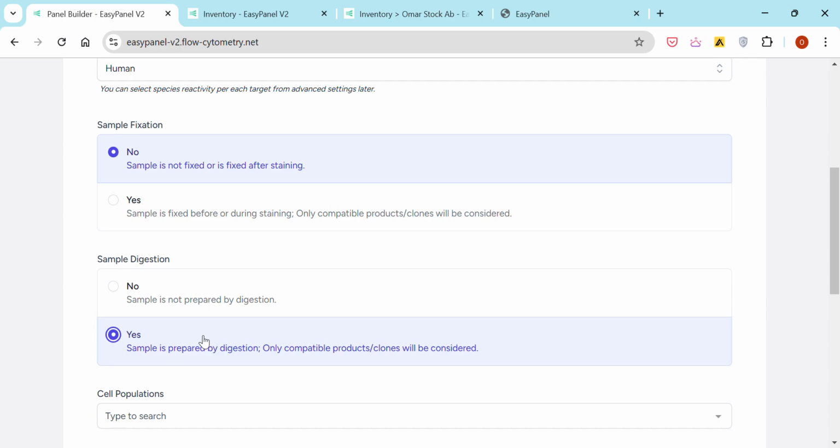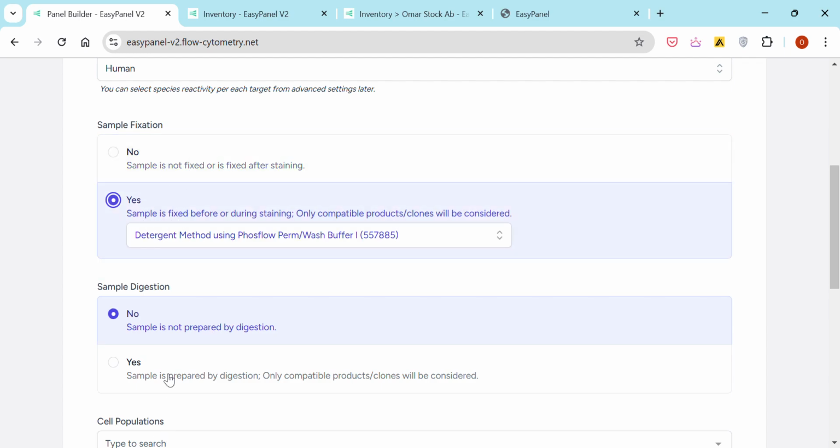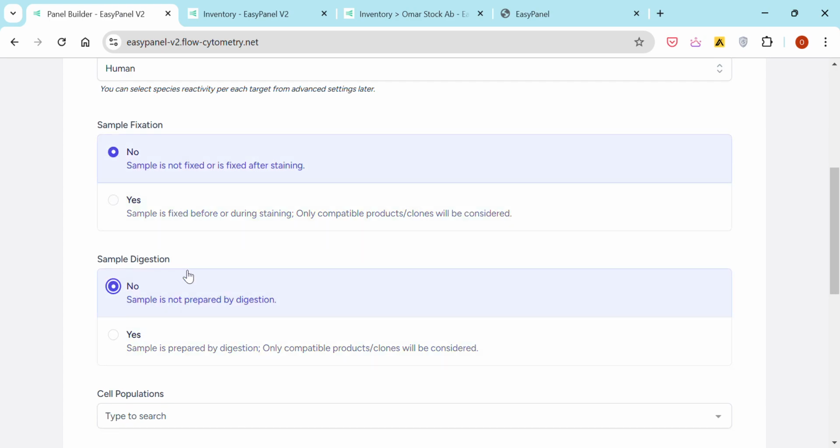And so we'd exclude these. We have a large database of which antibody clones work or not in case of these different preparation methods. These data have been shared with us by vendors or have been mined from the literature or different sources. But anyways, this is really important to fill.